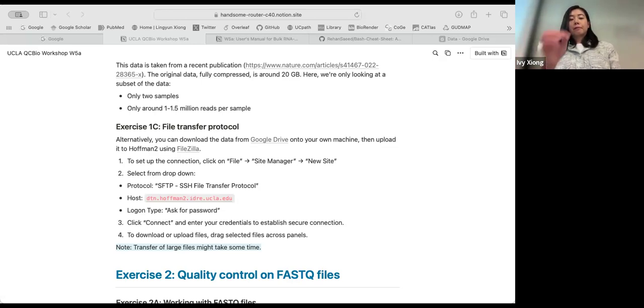Ooh, that's cool. I don't know what I'm looking at, but that's cool.